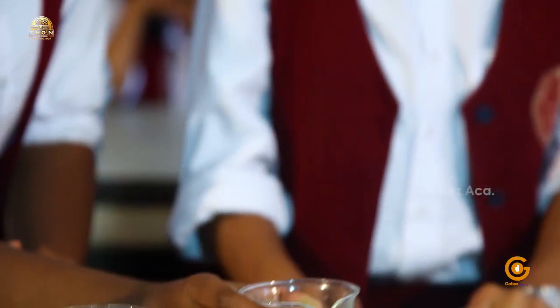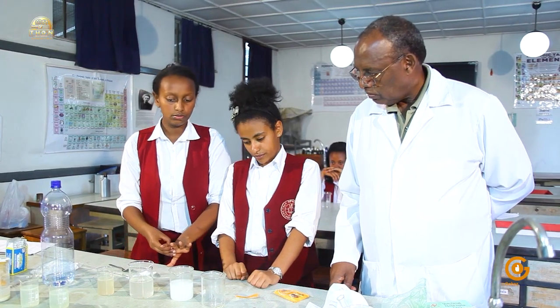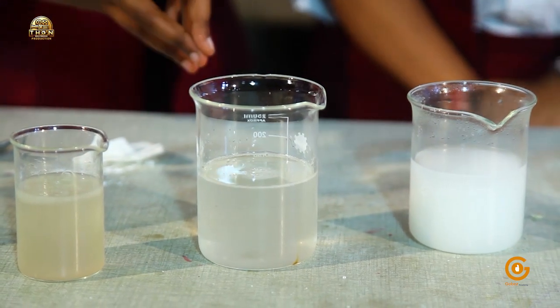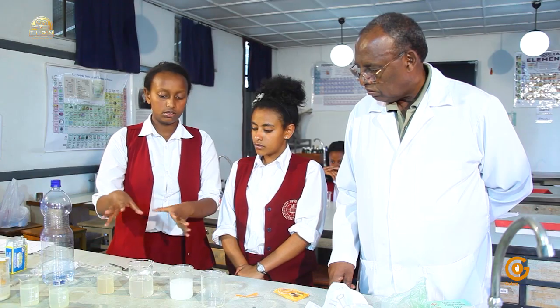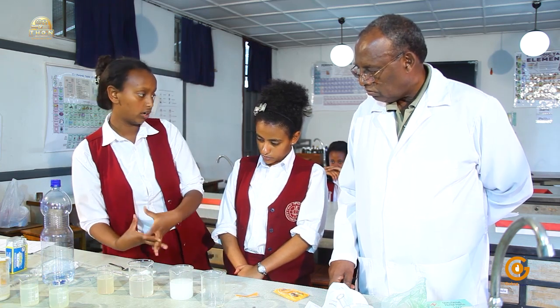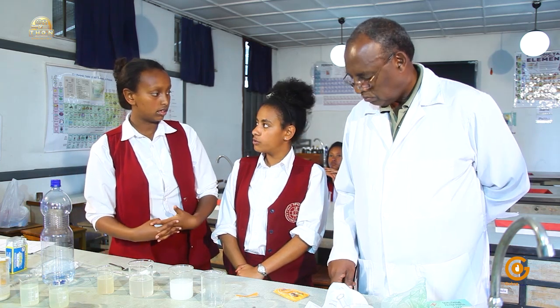Yes, so now as you can see, we have an equal volume of water. We have added equal solute and we have stirred all of them, so that can't be the factor affecting them. So what do you think is affecting the solubility? Some residues are left here, the others have completely dissolved. So what factor do you think is playing a role here? I think it's because water is a good solvent.